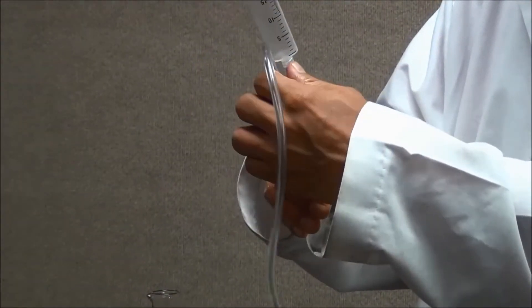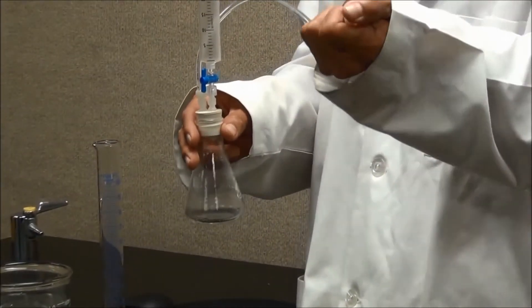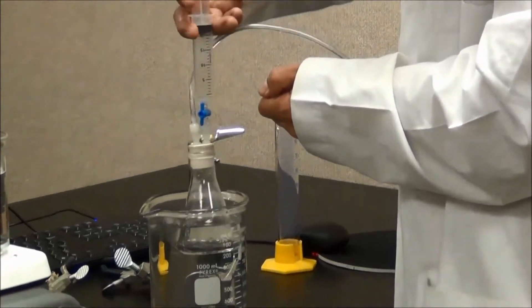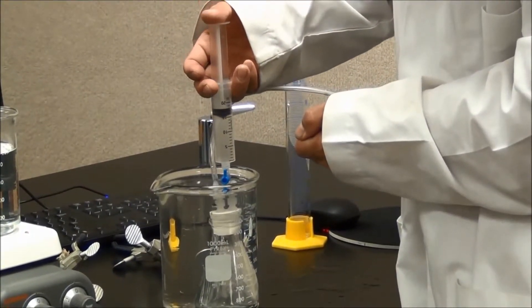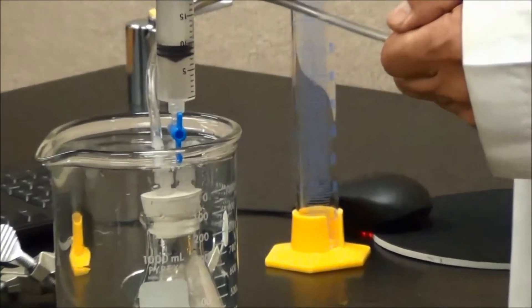Turn the valve into the open position. Use your finger to seal the end of the plastic tubing. Immerse the flask and the rubber stopper completely in the water. Then push down the plunger of the syringe. If there is a leak, you should see bubbles coming out.